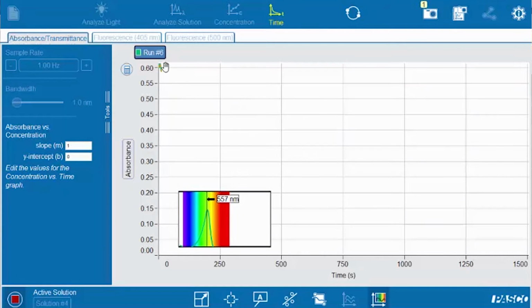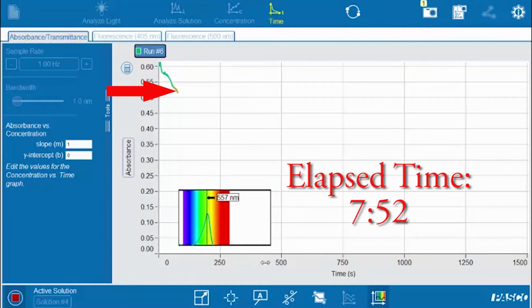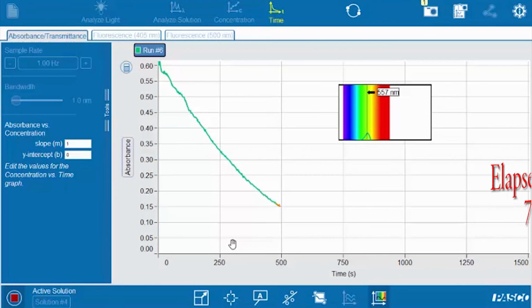So at this point, you are going to just follow this reaction as a function of time until your absorbance falls below 0.15. When it gets below 0.15, then we can hit the stop button. So now we will wait and watch and see what happens. So now that our absorbance has fallen to 0.15, I will press stop.